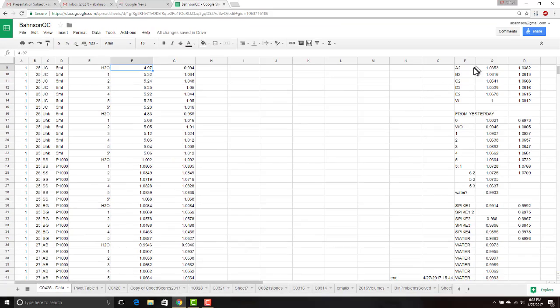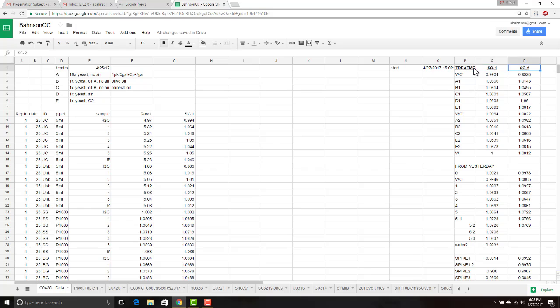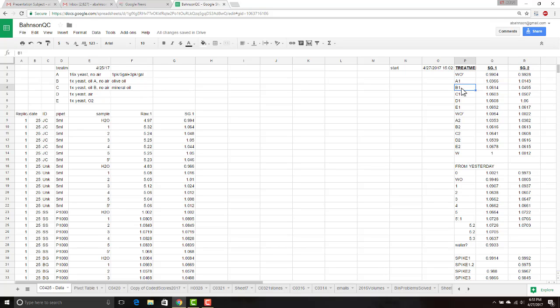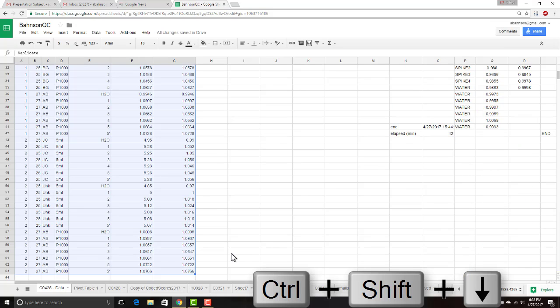Anyway, by putting all the data into this form, it allows you to use... actually, let me interrupt that sentence to say that I gathered additional data over here today for the specific gravity, and I did duplicate measurements of samples drawn out of each gallon brew treatment. Okay, so I did all that as well, but I'm just dealing with comparing these samples that you guys did yesterday and that I repeated again today.